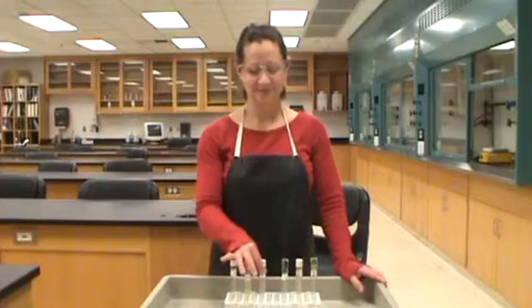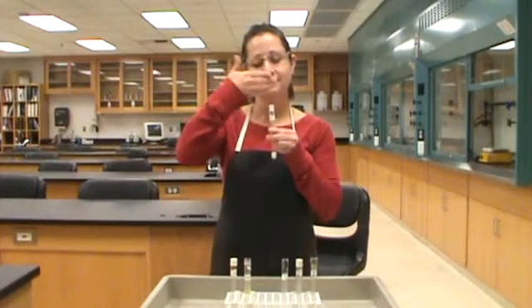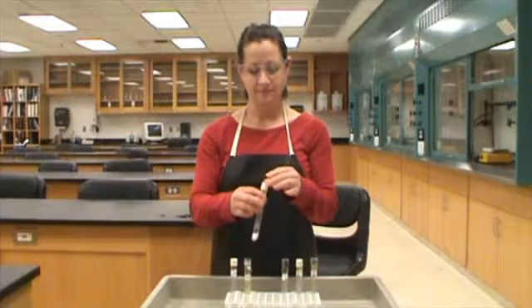When you smell a chemical, you never put your nose near the glassware. You use your hand to waft the odor toward your nose. Don't inhale, just a quick sniff. Make sure to put the cap back right away.